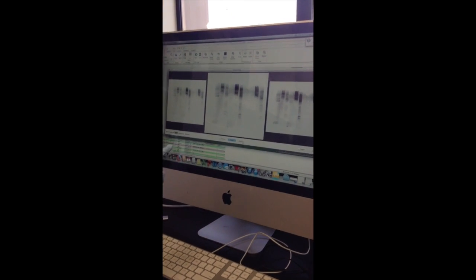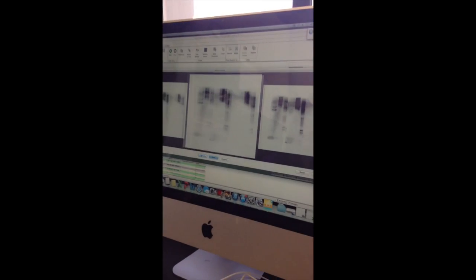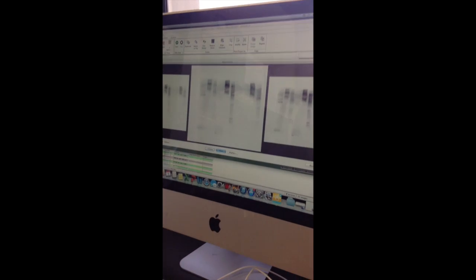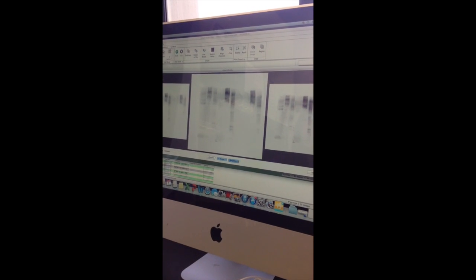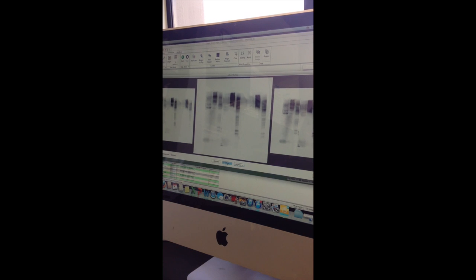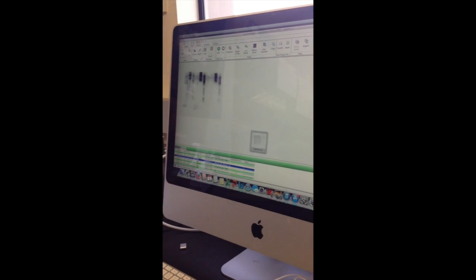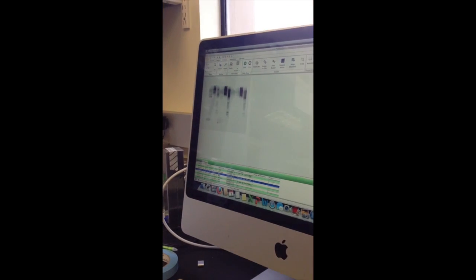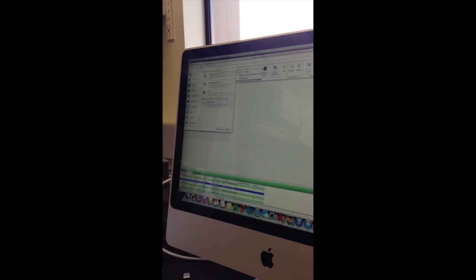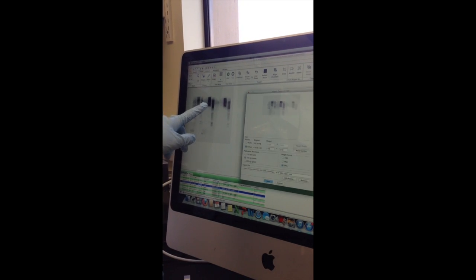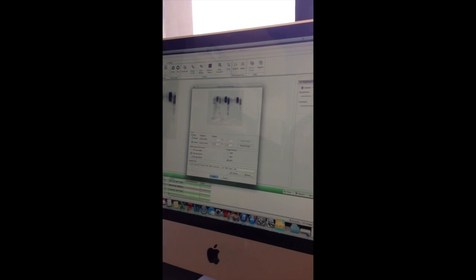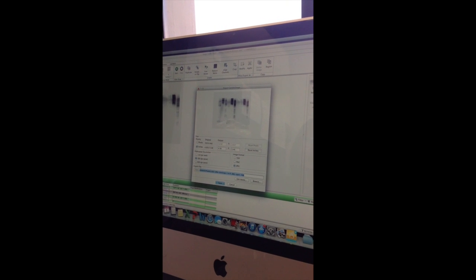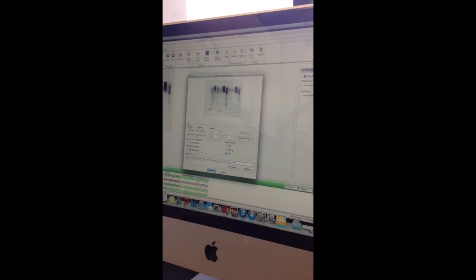And you can go brighter or dimmer, and I like this one, so click done, and then you can just save your image by exporting it, the single image, the current image, to wherever you would like. You just change the export file. That's it.